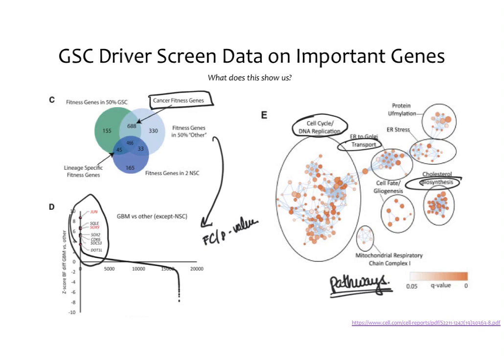So looking at pathways can be really helpful to identify genes that might be good targets and to also understand what's going on at a global level. That's one of the big things the screen allows, is to actually do that understanding, whereas just going after a few genes would never allow you to understand what's going on at a pathway level.